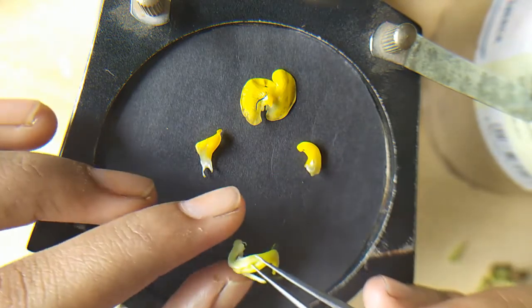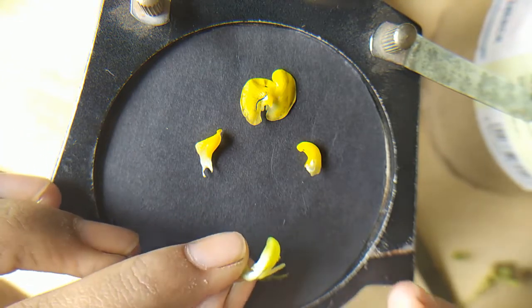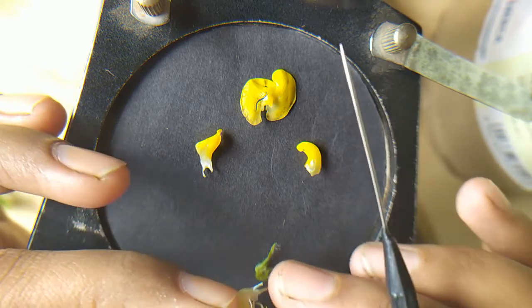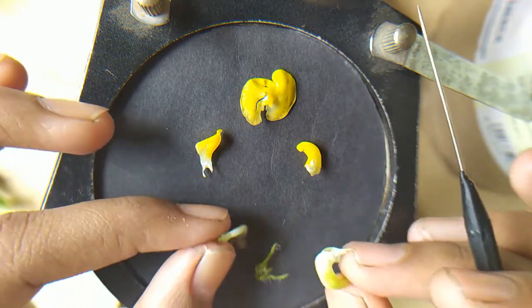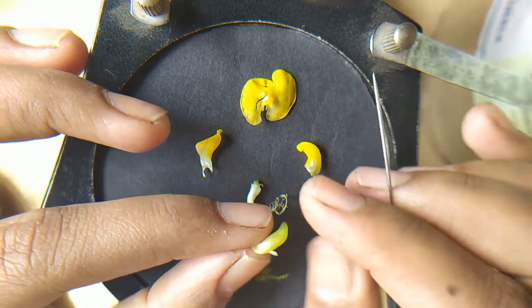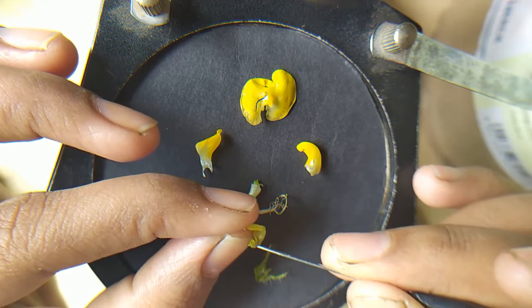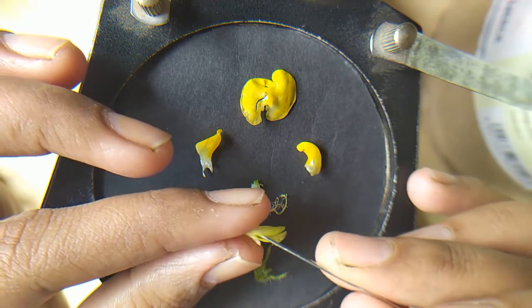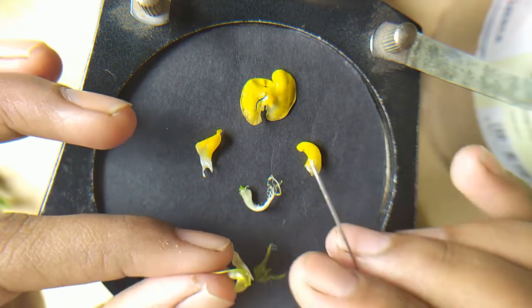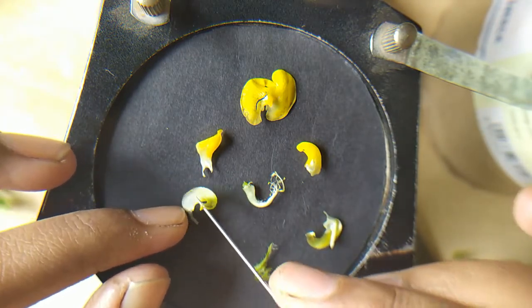Then see here, the keels are present here and the keels are free from each other. If you see here, the keels are free from each other. Then remove them; either you can give a cut to these keels first and then remove from the base of that flower, or otherwise remove the cone shape of the keels and then give a cut to the keels. Then the keels are separated from each other, and I have to arrange the same here.